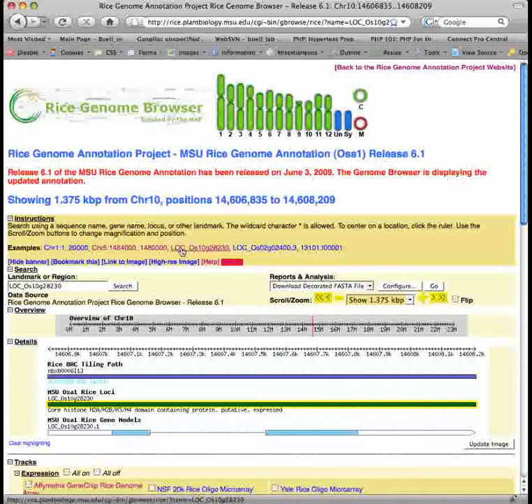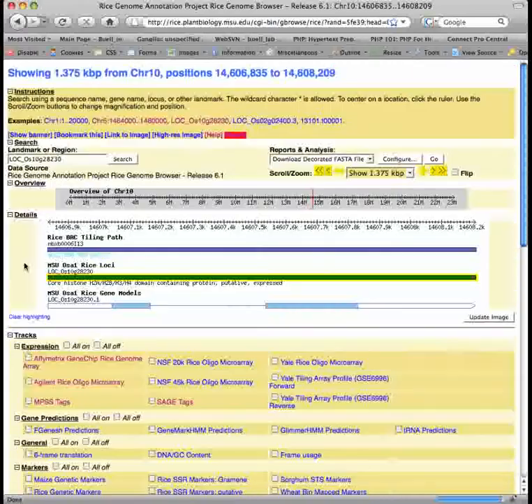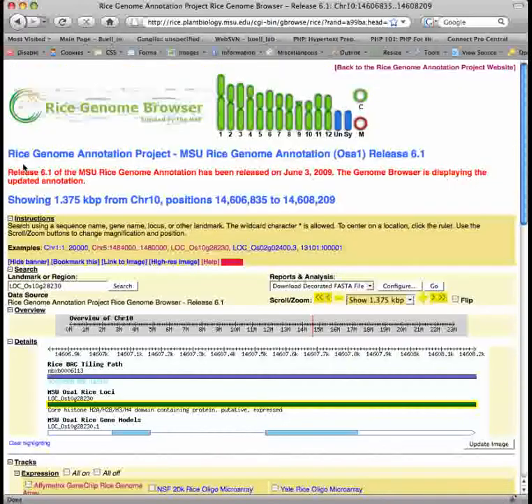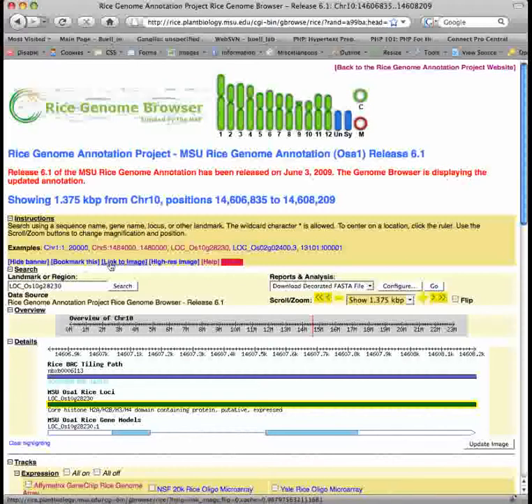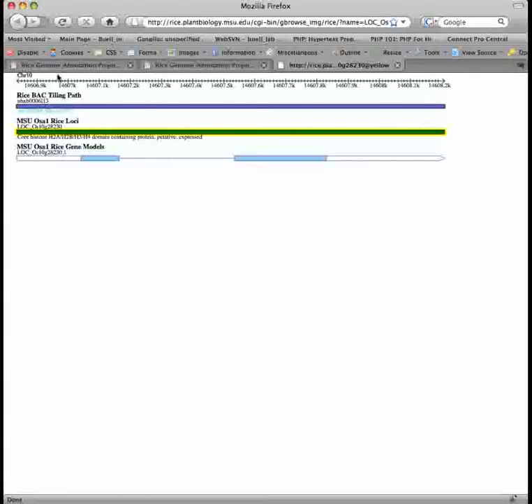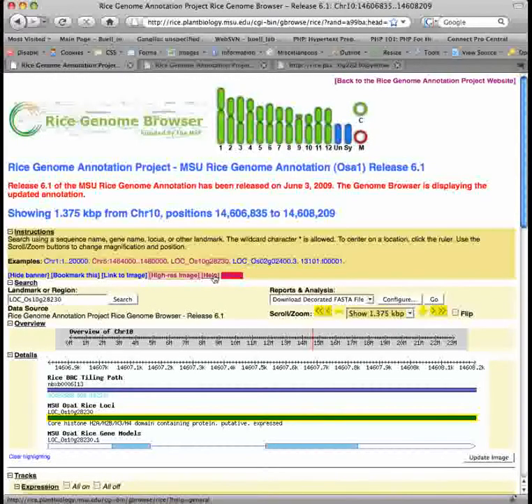If you do not wish to see the banner at the top of the page, you can click hide banner, and if you wish to see it again, click show banner. You can also bookmark the currently displayed chromosomes and track page. There is a link to the image, and you can also view a high-resolution image. You can click help at any time.